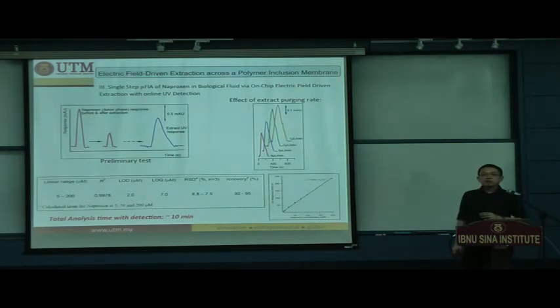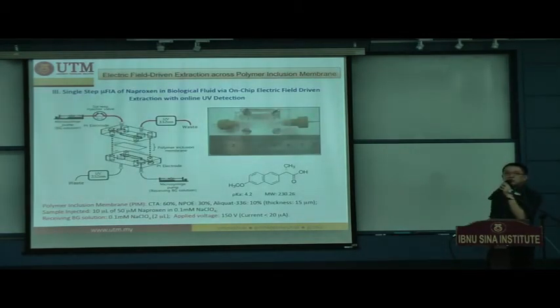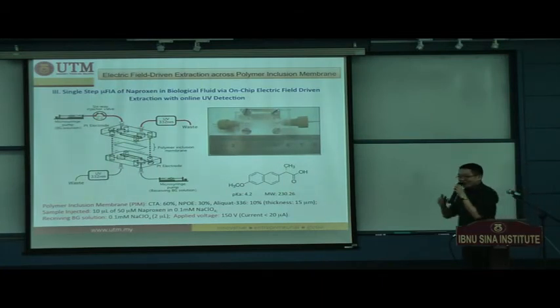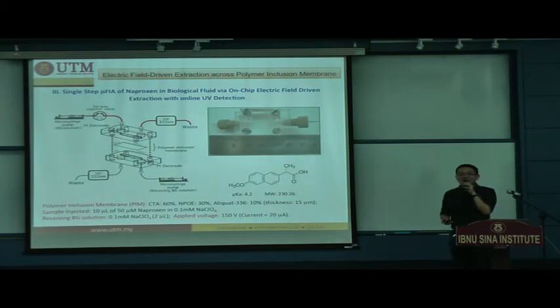About the UV chamber you showed us, number 5. You mentioned the UV detection at the top right side, so the UV was inside the chamber? No, you just connect a tube to flow through the UV. This is not a normal UV spectrophotometer.